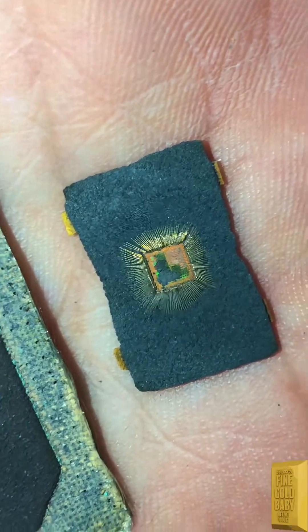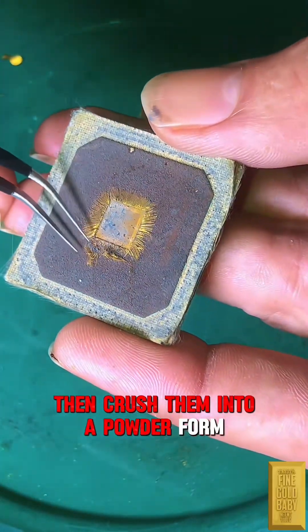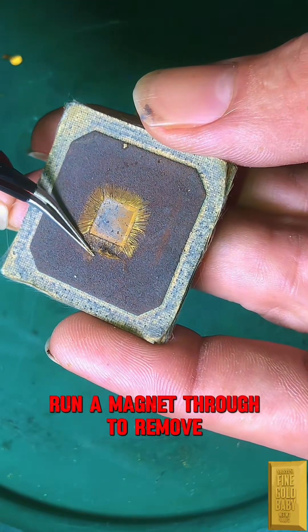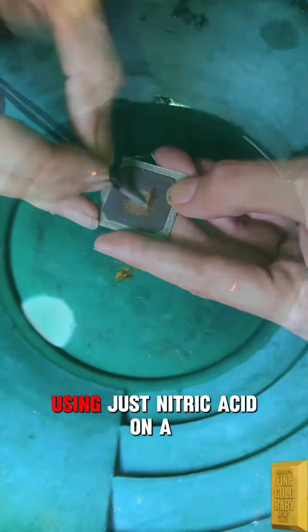For profit, toast your computer chips over any fire, then crush them into powder form. Run a magnet through to remove any unwanted metals, then pan your gold. I'm going to do a gold recovery video using just nitric acid on a few pounds of integrated circuit chips to prove the cost versus profit doesn't add up.